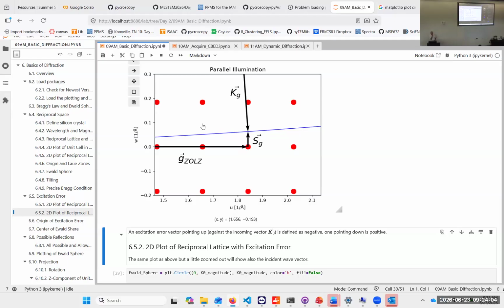The key here is, again, thinking in the duality of real space and reciprocal space. A sample, not to scale, looks more or less like a cell phone, right? It's very thin and wide. And how does that look in reciprocal space? In X and Y, it is extremely small, right? And in the Z direction, it's very high. And that's the excitation error.